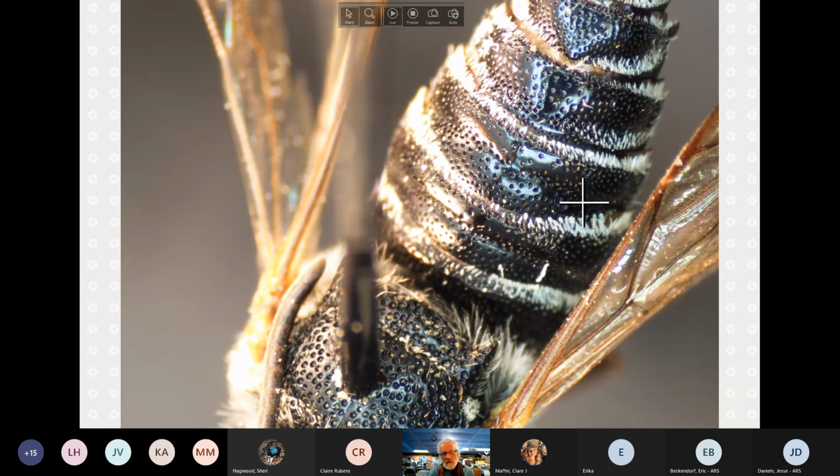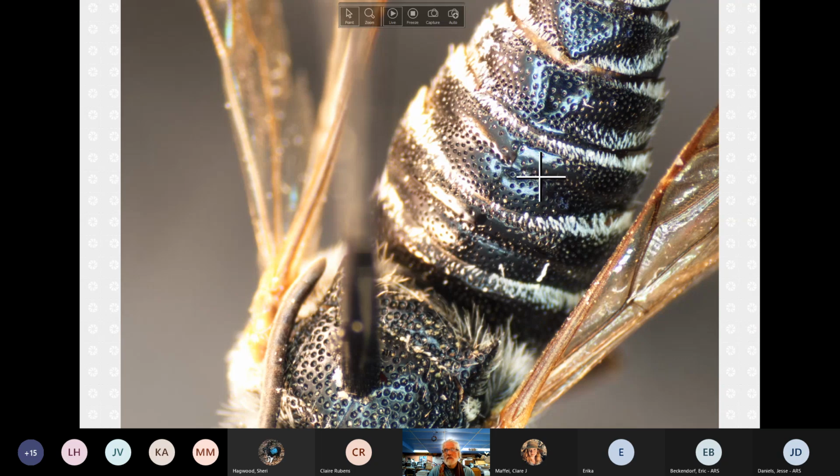Now, T3 is the one that differentiates us between sayi and octodentata. You can see there's heavily pitted areas in a groove off to either side, and then it sort of fades out. But the problem is it's not absolutely no pits and absolutely flat. It's in comparison to what you'll see in octodentata. This is relatively ungrooved, a little bit difficult to see because there's no 3 dimensions here, and then this pitting is a whole lot sparser.